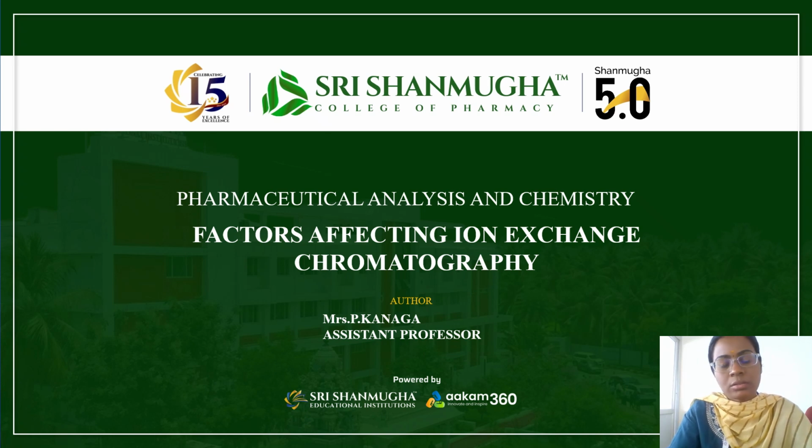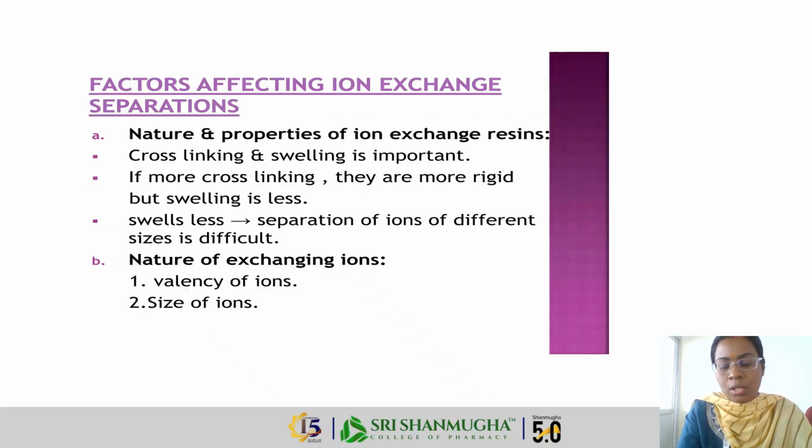Today, my topic is factors affecting ion exchange chromatography. So, we are using ion exchange for chromatography. Chromatography means a separation technique used for the separation of multiple ions or molecules, atoms, whatever they are. So, what are the factors involved in affecting the ion exchange separation?